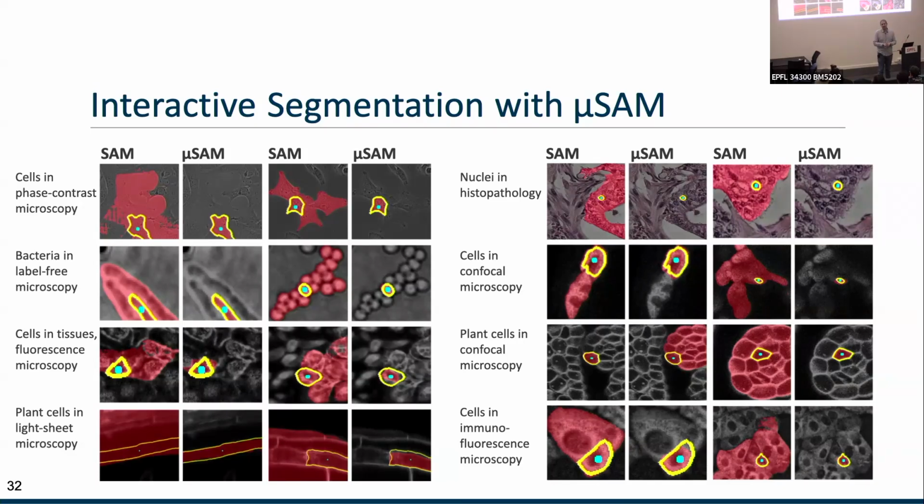In detail, the trunk, or the big part of the model, only works in 2D, also in the SAM2 model. Then there are smaller parts at the end that go over time, or in our case, the depth dimension. It makes sense in general to do this, and we did this in some other work comparing different ways of doing it: do you mask randomly in 3D, or do tubular masking, and so on? But we don't want to redo this and just start from their trained weights. In our case, we wouldn't do this.